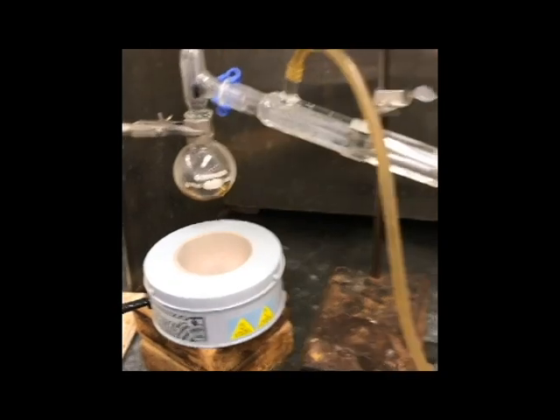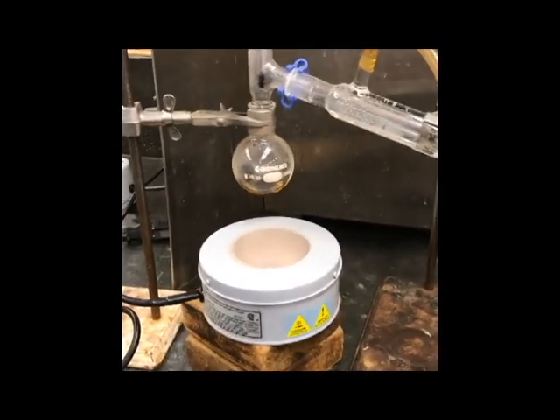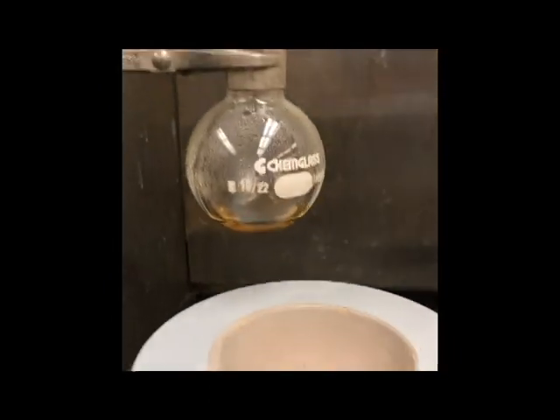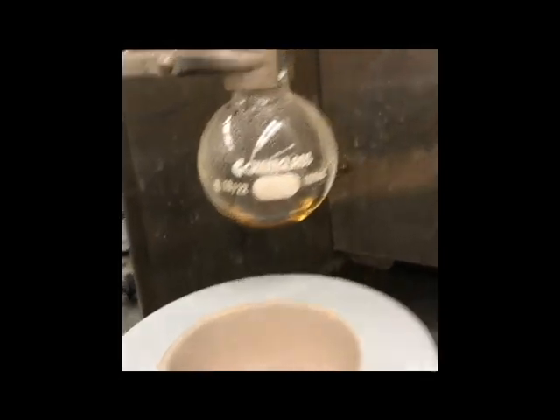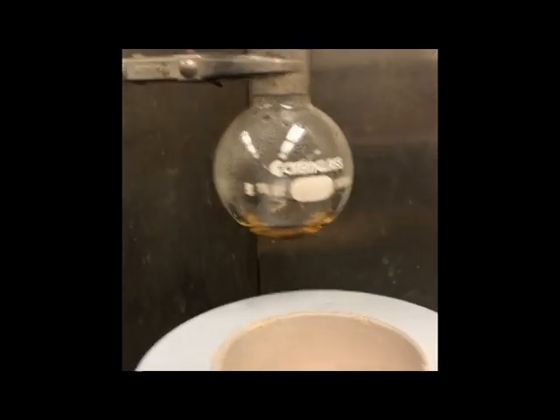Okay, so after about a half hour of the distillation, we've finished. We've taken the flask off the heat. It's cooled down for about 10 minutes now. You can notice that the leftover stuff we have in there has a kind of amber brown hue to it. So that would be something to note in your in-lab, hint, hint.